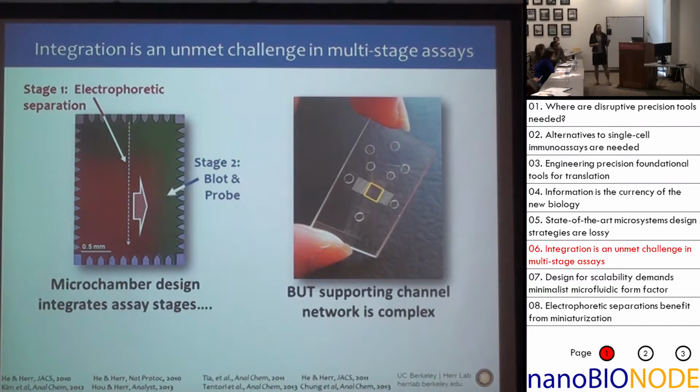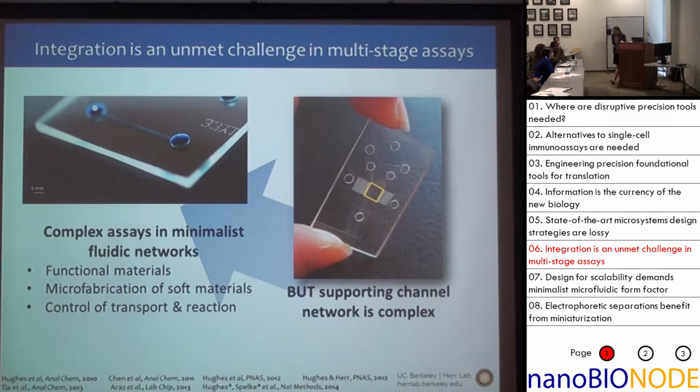No robotics though, right? And so with a graduate student in my group a couple of years ago, we challenged ourselves to say, what is the minimum framework that we need to be able to complete a Western blot? And our answer was a separation axis. We need one dimension for sizing, right? We need to be able to resolve the species from each other using electrophoresis. And so as a separation scientist, that means we need two wells, one for the sample and one for the waste, and then an axis here so that we can do sizing.